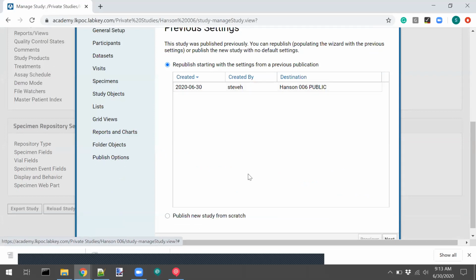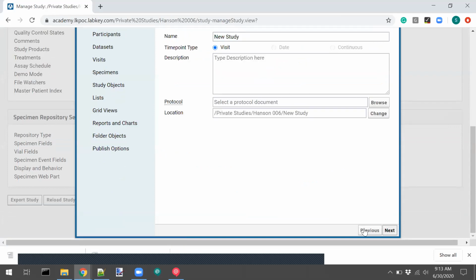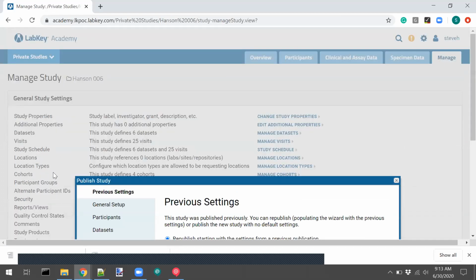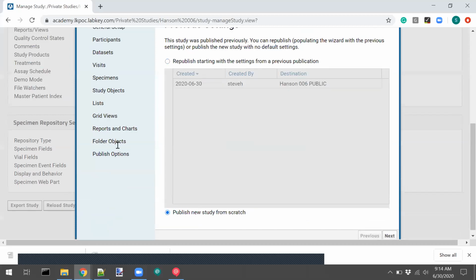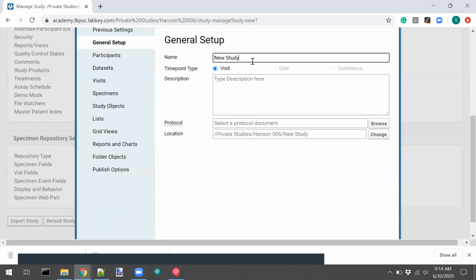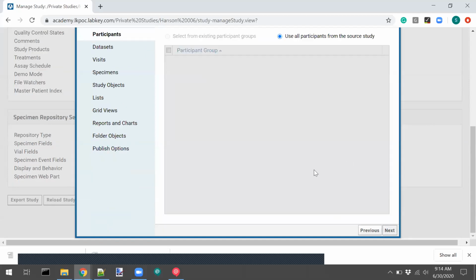Actually, you know what? I take it back. I am going to redo the public one. And it's going to let me go through the wizard all over again. Well, actually, I take it back. Did I do something? No, I'm in the right place. I'm sorry. I'm going to do this all over again. I'm going to start a new one. Let's call it 007, just to give it a unique name.